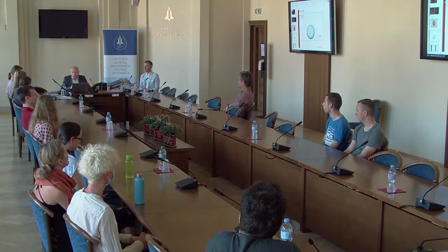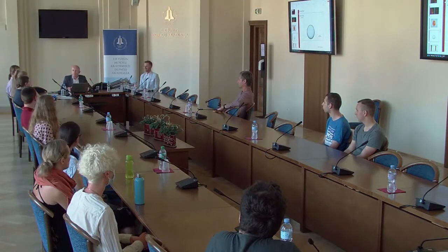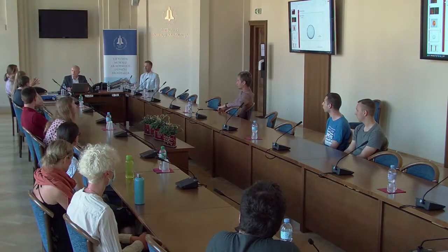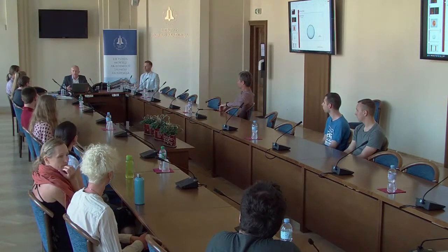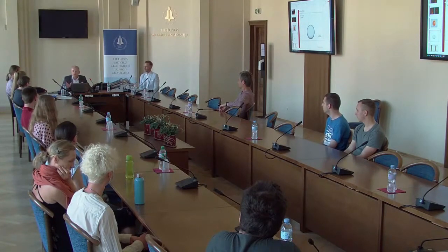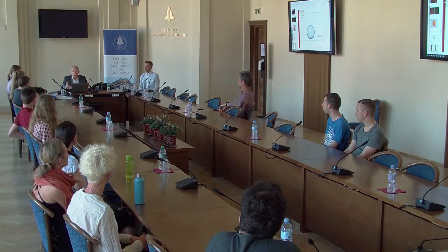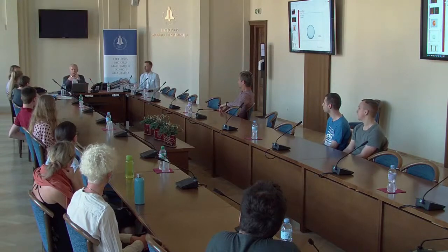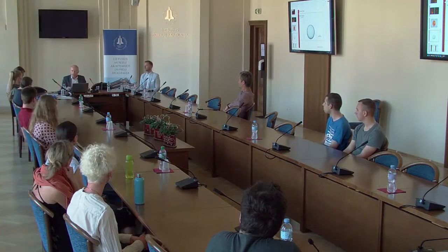Bet jeigu aš čia pradėsiu tą rodyti, mes niekada nebaigsim, nes pradėsim nagrinėti visus laisvus, kaip atrodo. Kaip? A, kaip užtrauki? O, vaizdą? Ne. Aš, tarp kitko, dantų neklijuoju visai. Aš paimu putplasčio gabaliuką, jį spaudžiu. Putplastis labai lengvas, su tomis energijomis, kuriomis aš žiūriu dantį ir iš danties išgaunu gerą kontrastą, putplasčio beveik praktiškai visai nematau. Net jeigu ir matyčiau, jis yra kitoj vietoj. Net jeigu visą dantį kiščiau į putplastį ir matuočiau, aš gaučiau vaizdą, čia yra putplastis, o čia dantis, ir aš galiu dantį žiūrėti. Nebent klijai gali sugadinti dantį, bet man atrodo, nieko tokio.